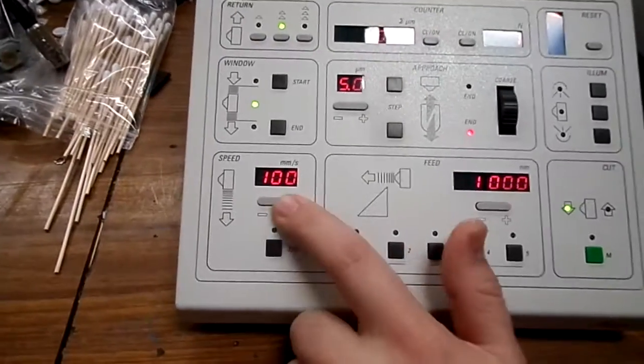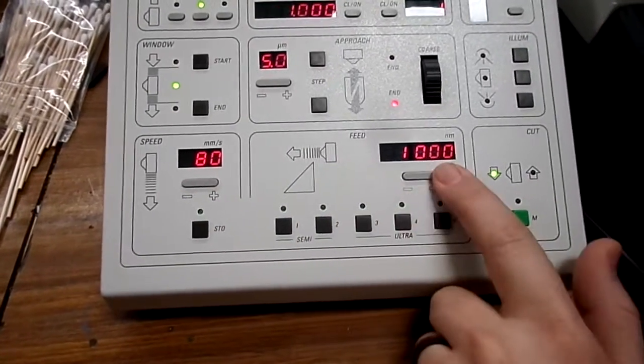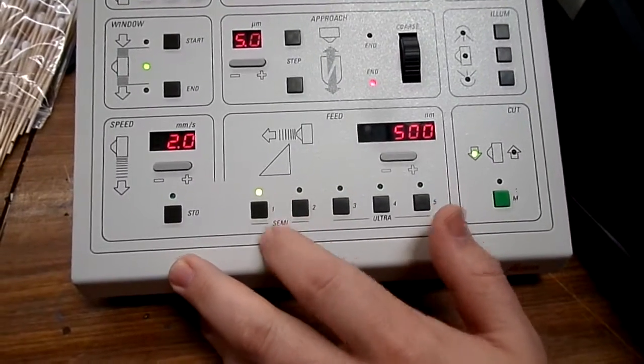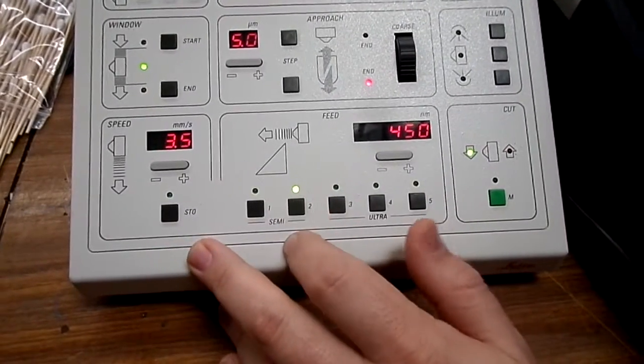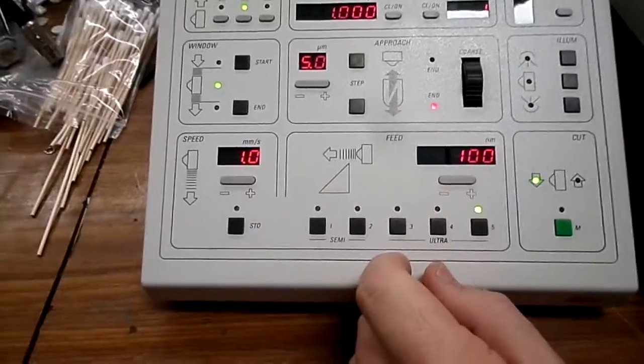You have your speed, up and down. You have your feed. You can adjust these manually. There are certain programs already in the machine. You hit the button twice to select it. Different thicknesses and speeds.